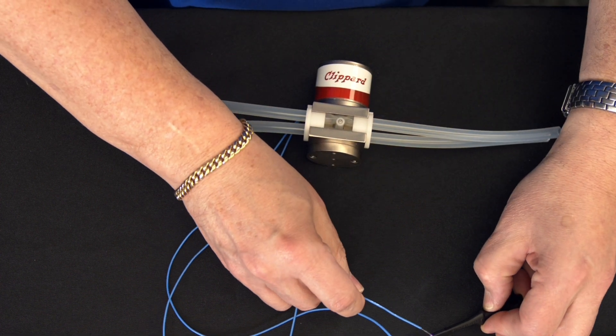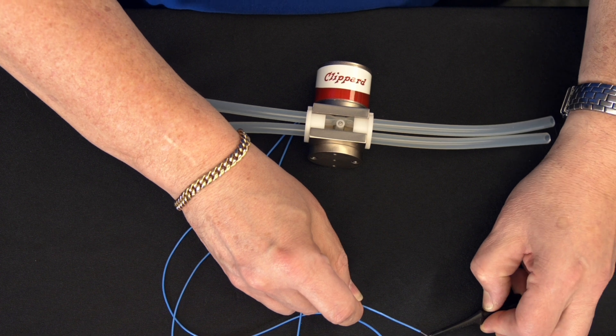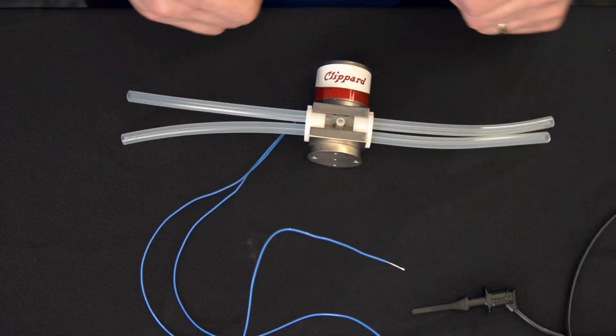And then all you have to do is energize the valve a few times to make sure that the valve turns on and off. There you go — that's how you change the tubing in the three-way pinch valve.